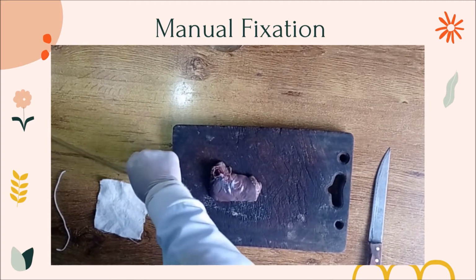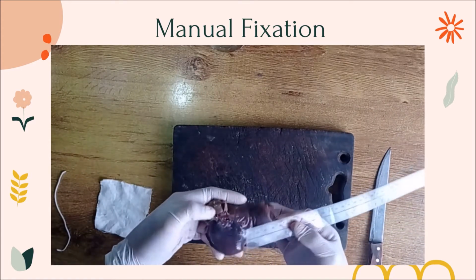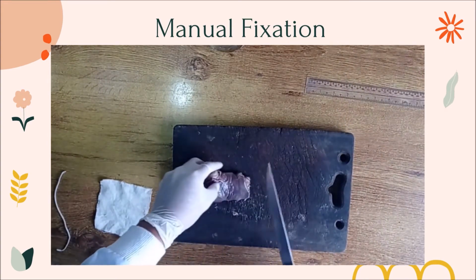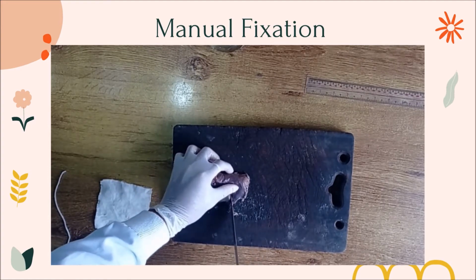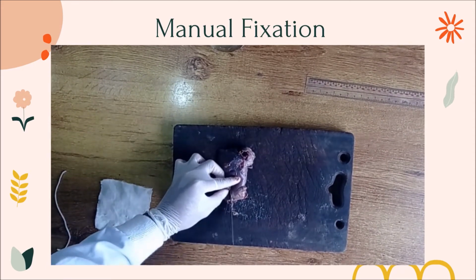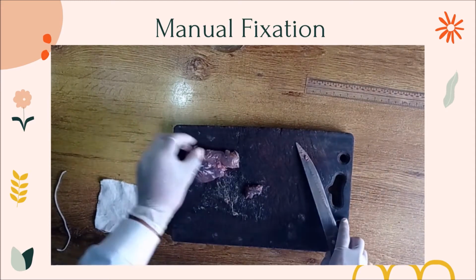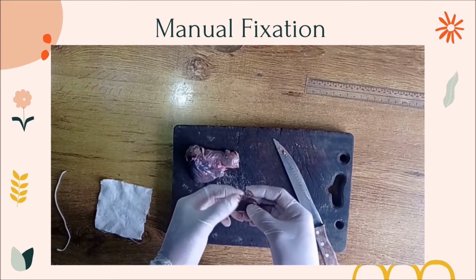But for this process, the fixation, we will first get the representative sections of the tissues. We will cut a representative specimen about 2 cm squared, but not more than 4 mm in thickness, otherwise it will not fit in our tissue cassettes. So we will cut it now. So it's already cut into the preferred size.